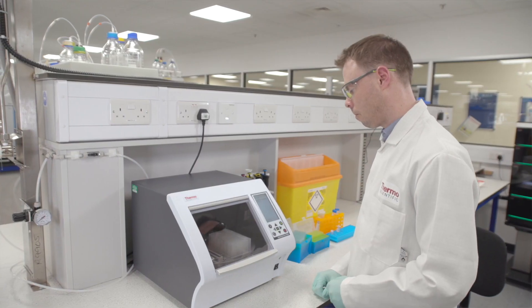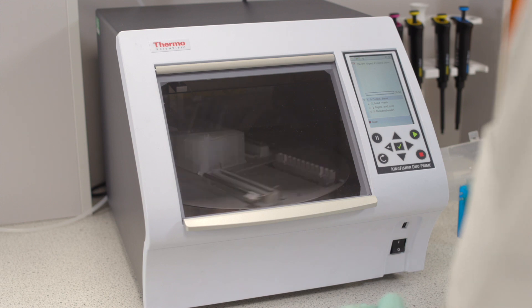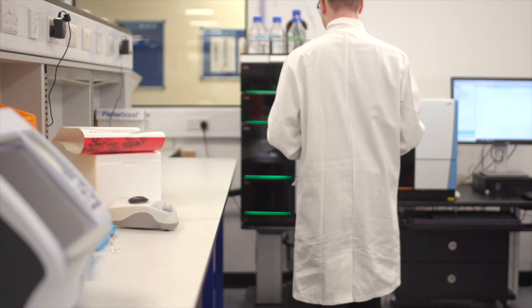Once you've loaded your plate, press OK and the protocol begins. Now your digest is complete, transfer your plate directly to the autosampler for LC analysis.